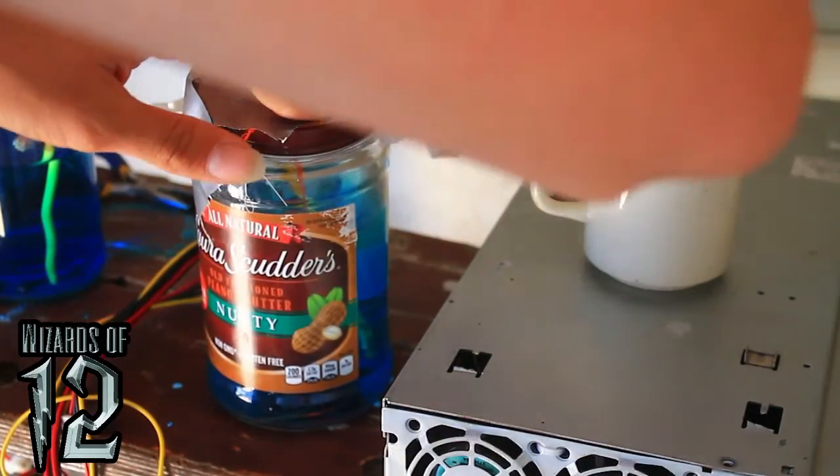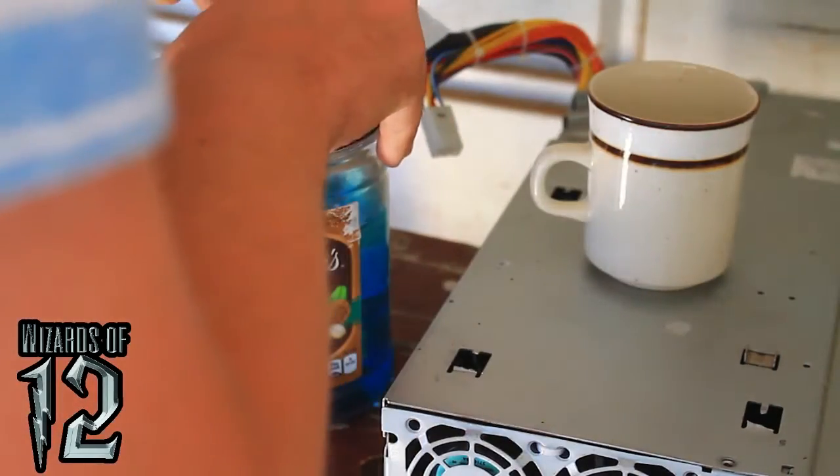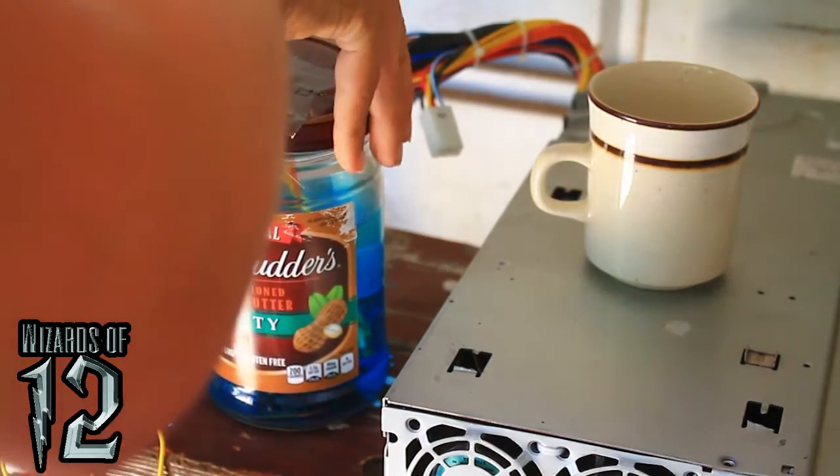The reason I have this duct tape on here is because I didn't want all the water evaporating, especially in the hotter months, so it's been nice and warm in there.